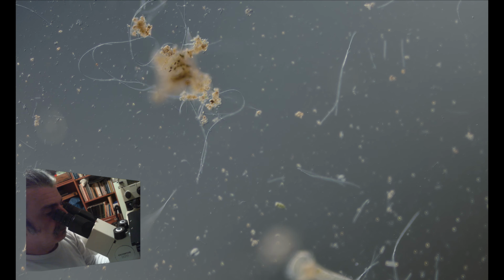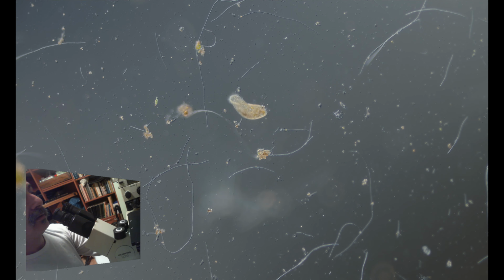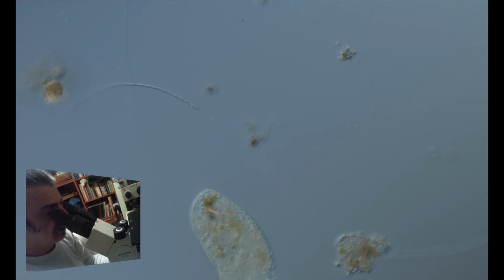Let's go back to 10. Another stentor, diatom, stentor. I think we got to the starting of our sample, yeah. And here we see a hypotrich. It's a ciliate. Let's watch it more closely.